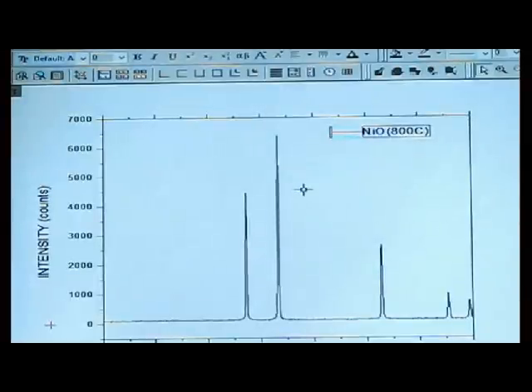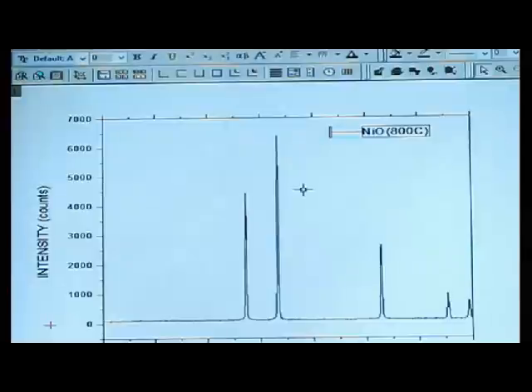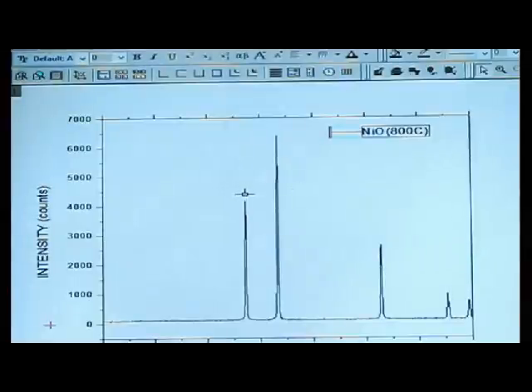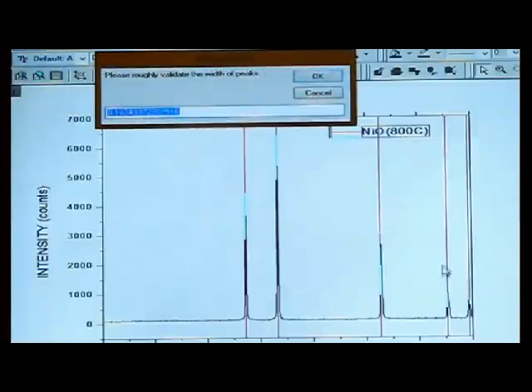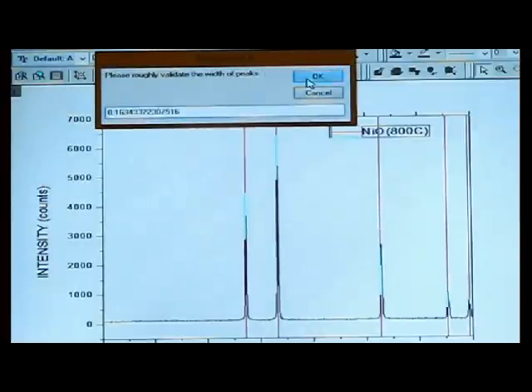We should double click on the peaks. First peak, second peak, third peak, fourth one, and the fifth one. Now click on OK.